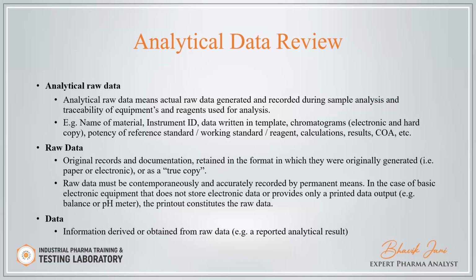In case of basic electronic equipment that does not store electronic data or provides only printed data, the printout should be your raw data. Whenever electronic data is not generated but your printouts are there, then your printout will be your raw data.